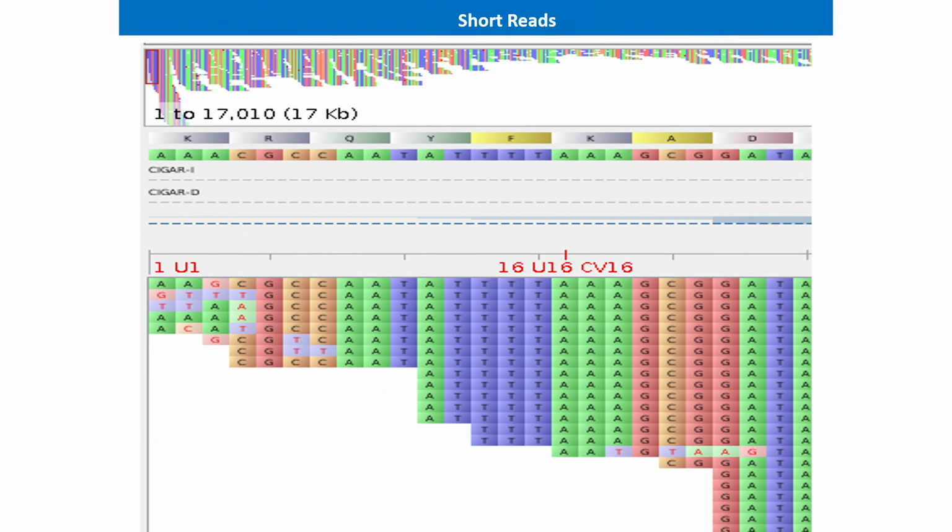Working with Illumina, you think it's really easy. You have as much coverage as you can. As you can see, the assembler will look if you have some mis-sequenced base, as you can see right over here, and the assembler will correct it and make it an A. But if you have shorter or less coverage within the bacteria, you will have a bit of a problem. If you have enough coverage, everything is solved.